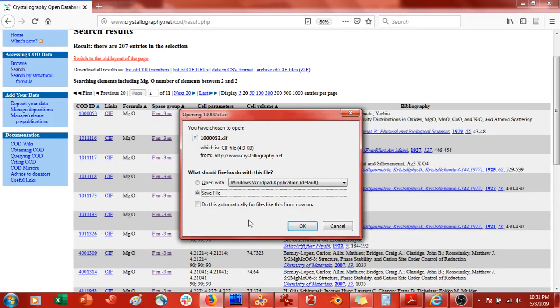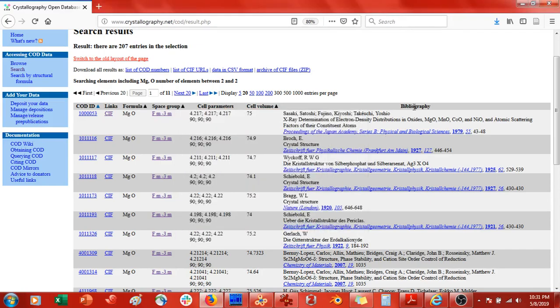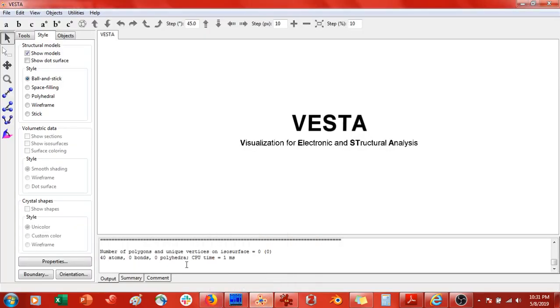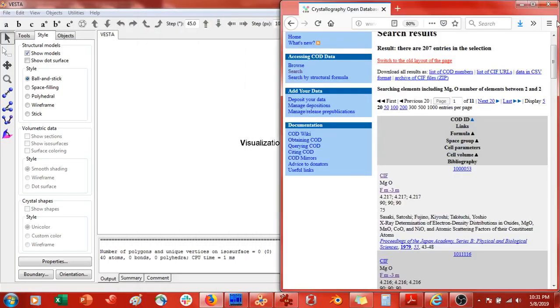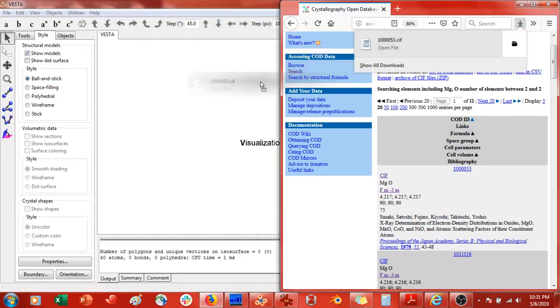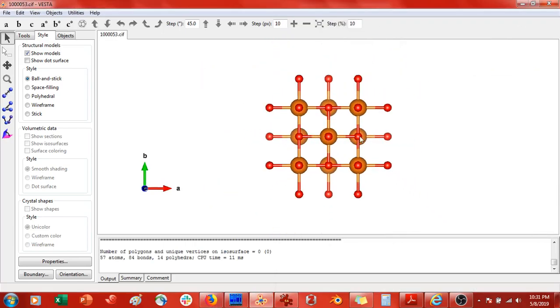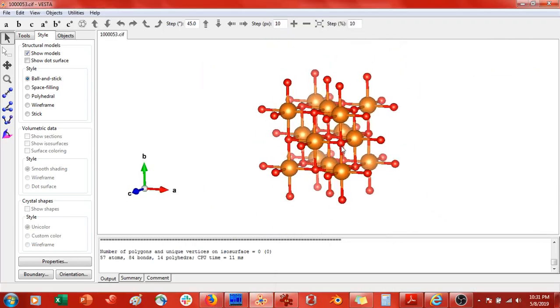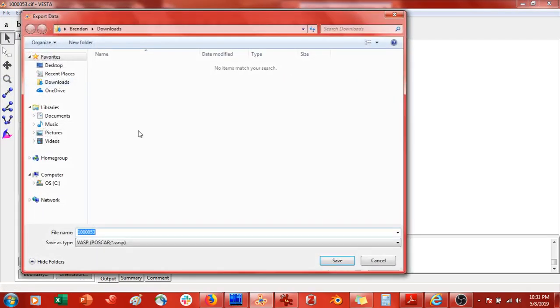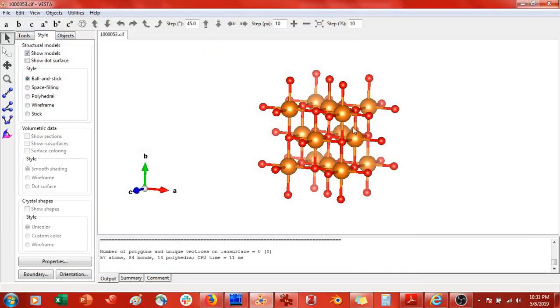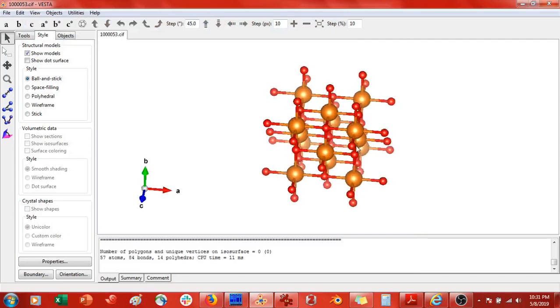If you're using Firefox like I am, it's going to say 'save file', so you save it there. Then you open VESTA, bring the Firefox window to the side, and simply drag the file in. There it is — you have your crystal structure. You can then export it as a VASP file, export it as an XYZ file, save it to your desktop, and load it again.